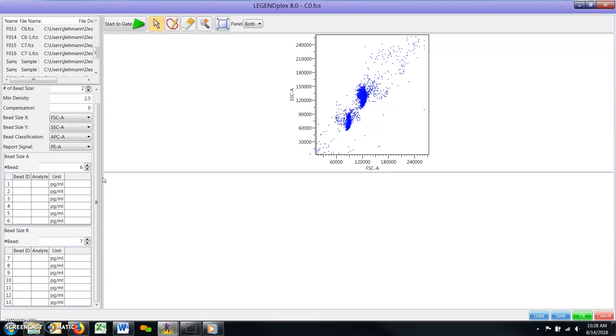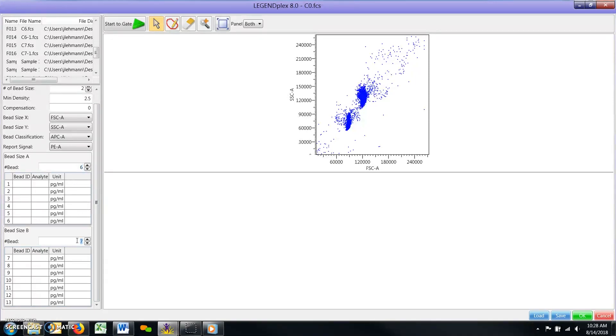Using the number of bead field, adjust the number of beads for both the A and B beads tables to match those found in your assay. Next, enter the bead IDs and analyte names for all targets in your assay for both the A and B beads tables.